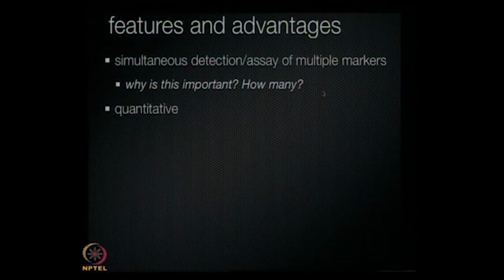Sure. Yeah. So the approach is also quantitative, because, of course, the intensity of the signal is proportional to the amount of the material that's gone down. And of course, you have to run calibration curves to keep the standards going. As we mentioned earlier, there are few false positives, because if things don't fall down on a grating, then it's just not going to be measured. And the information is real-time. Again, that's characteristic of all label-free techniques. It's a real-time measurement of the actual interaction. Right. And therefore, you can extract from it kinetic information, binding information.